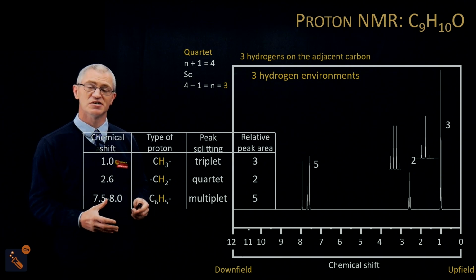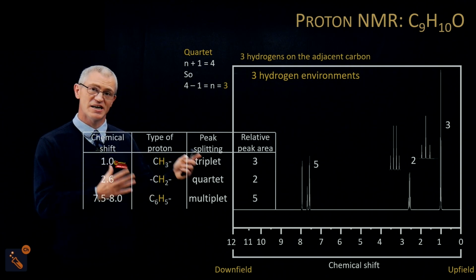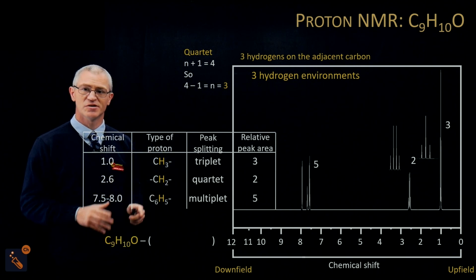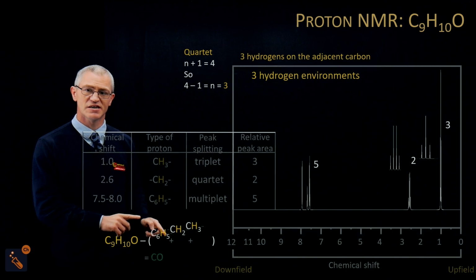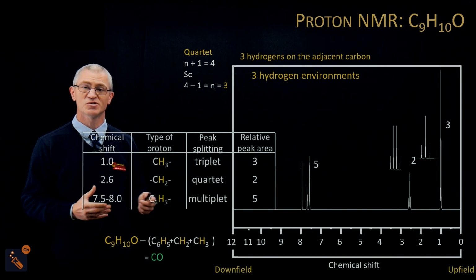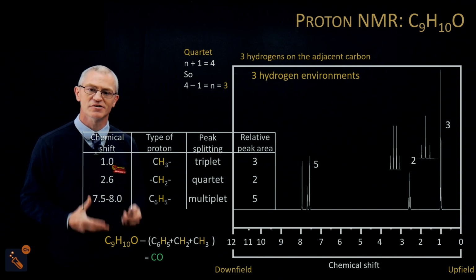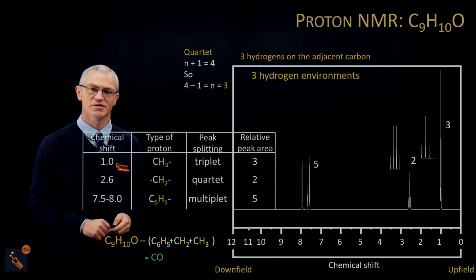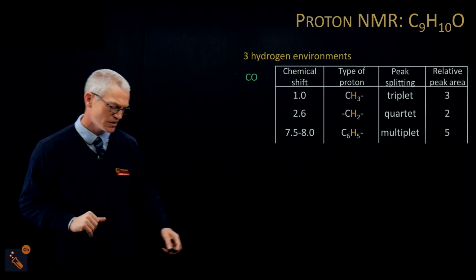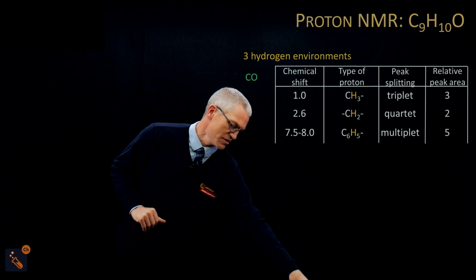And then lastly, what we're going to do is look at what's left in this molecular formula. So here's our total molecular formula, and then let's take that down, and you can see all of this added together means we've got a CO remaining, which again says we've probably got a ketone. Okay. So from that, let's move it all up, and let's start putting it together.